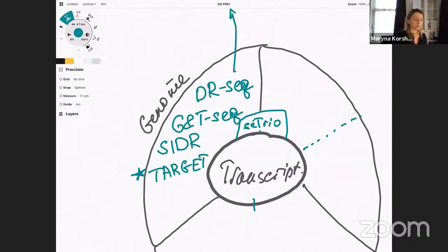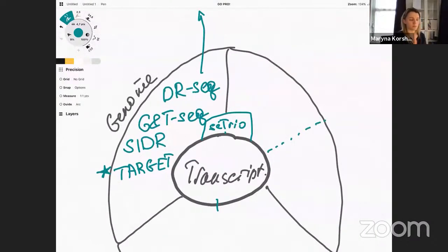It was first developed for cancer cells and oriented on copy number variation and methylation changes in these different cancer cell types.